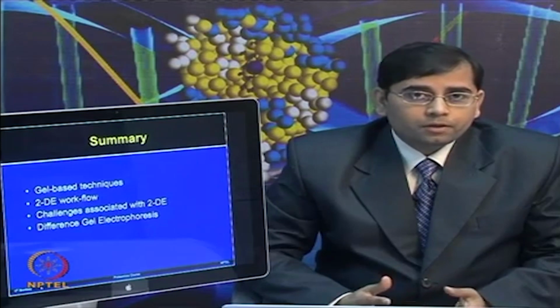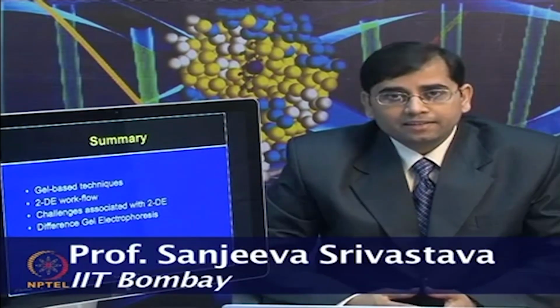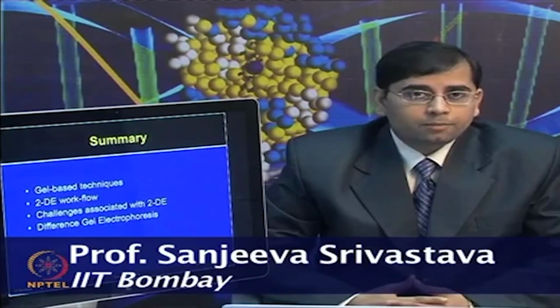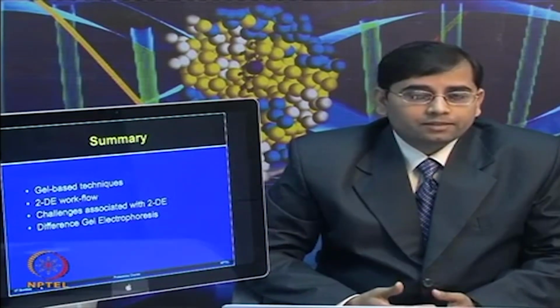So, I hope by taking this module on gel based proteomics, you are now familiar with different types of gel based techniques. These are only a few, and there are many other methods available as well, but these are the most commonly used methods which people apply in the field of proteomics.